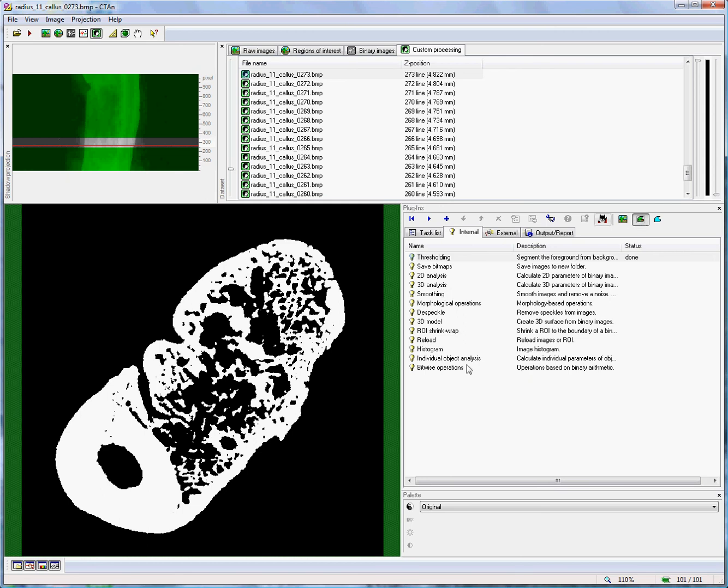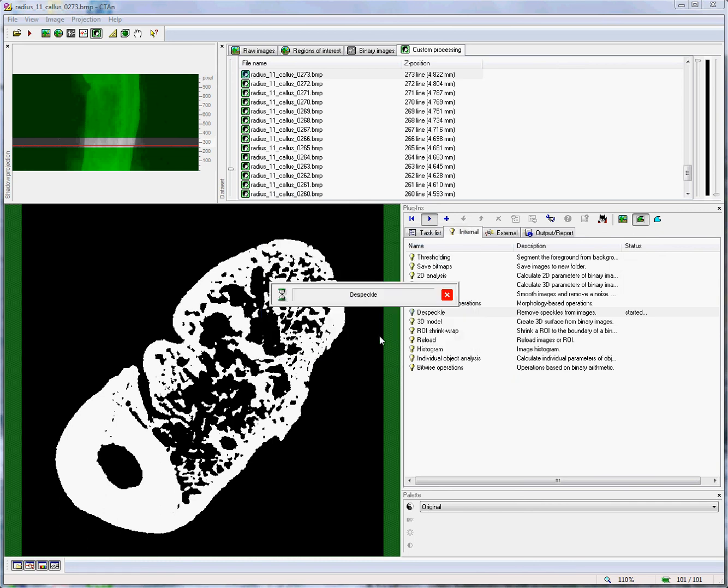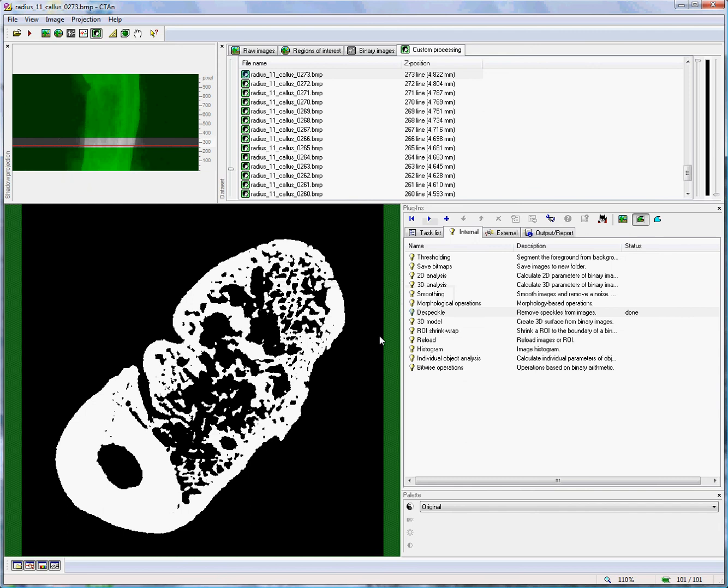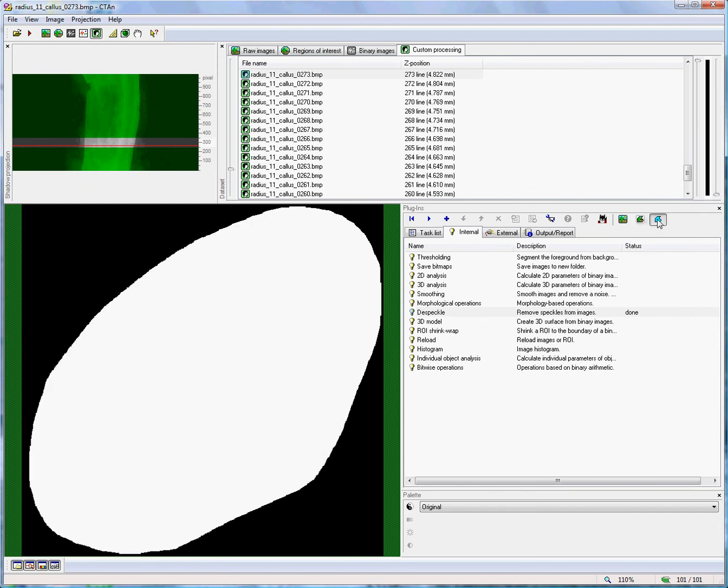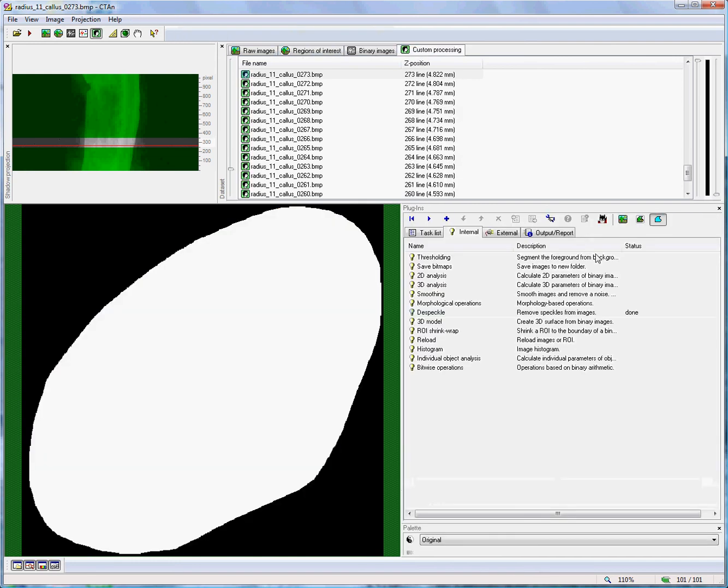Now, I'm going to run a despeckle function just to remove any small dots of noise. Remove white speckles, 3D space, less than 40 voxels from the image. With that done, we can look again at the region of interest, and it is now the same as it was set in the region of interest page.